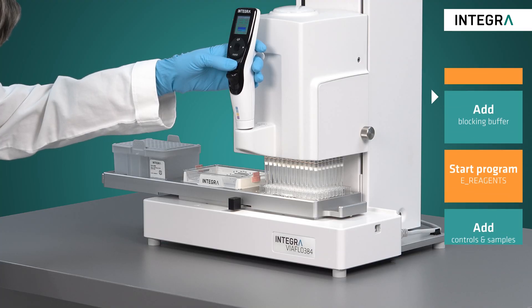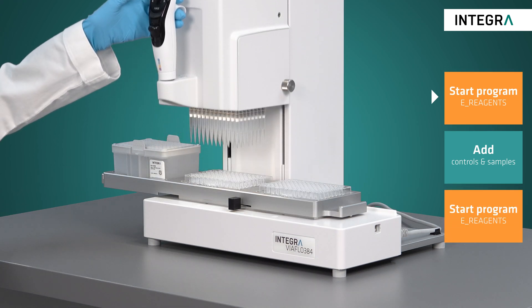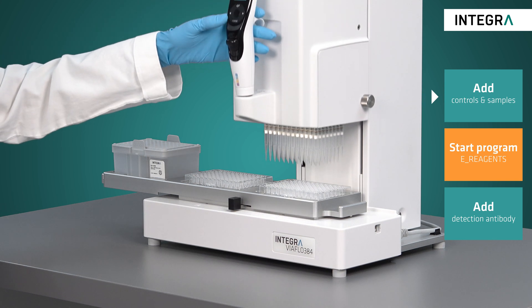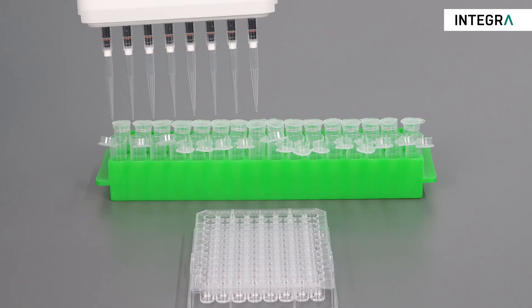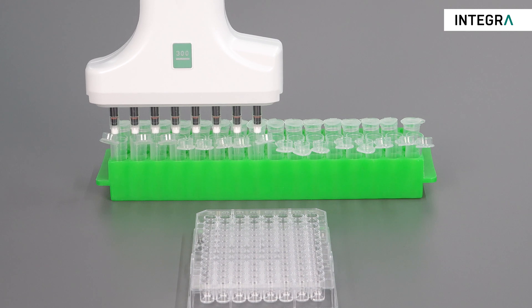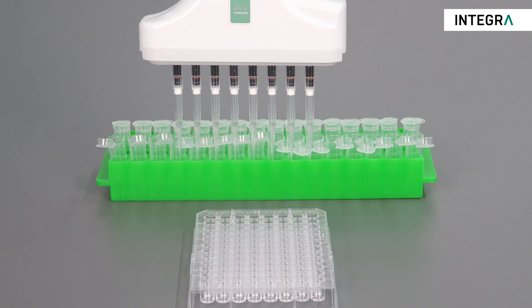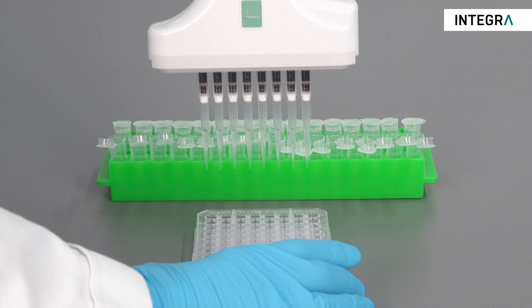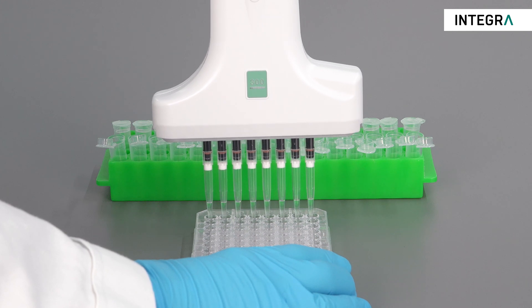After adding the blocking buffer, the plate is incubated again. Now it's time to add our samples. In our example, the samples are already set up in a 96 well format. Of course, if your samples are stored in microcentrifuge tubes, simply use the Voyager adjustable tip spacing pipette and reformat your samples from the tubes to the plate at the simple touch of a button. This not only saves time when compared to a single channel pipette, but reduces transcription errors as well.